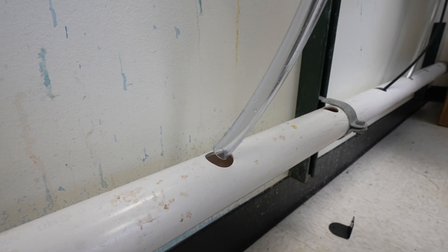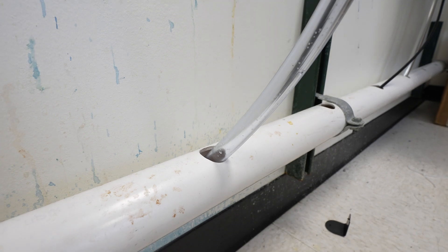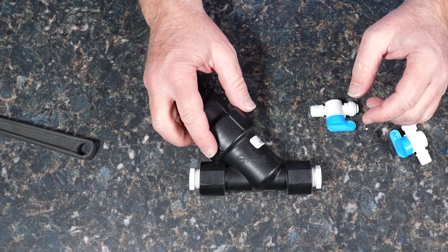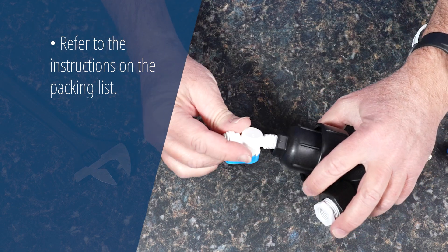Install the analyzer near an open drain, where the analyzer drain can be routed with a continuous downward slope. Assemble the Y-strainer before you begin installation at your location.